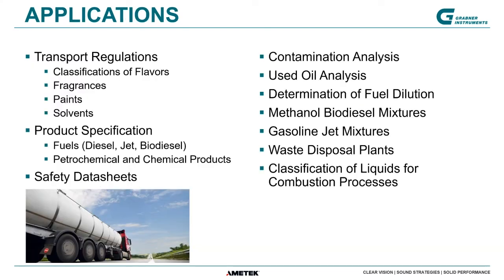Why do we need the flashpoint? Basically it's something which you use especially to declare the safety for transport, classification of flavors, fragrances, paint, solvents, all kinds of samples that are flammable need to declare the flashpoint before you can transport them. For product specifications, especially for diesel, jet and biodiesel, the flashpoint is required, but also for other petrochemical products. And all this comes then into safety data sheets which are compiled out of this.